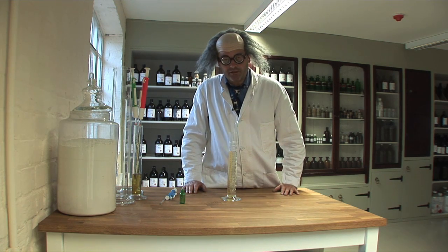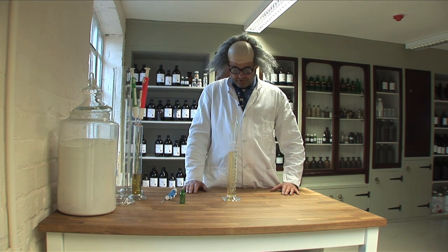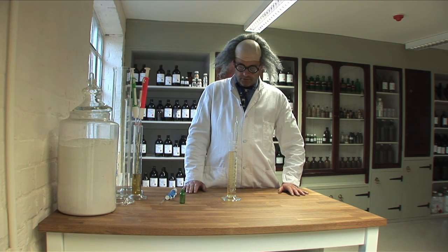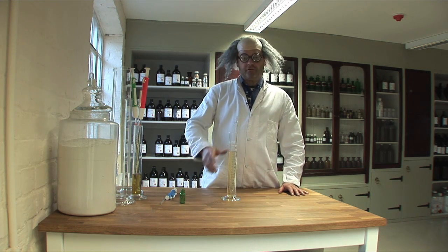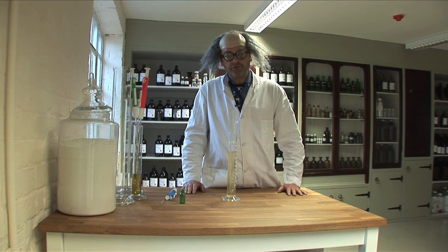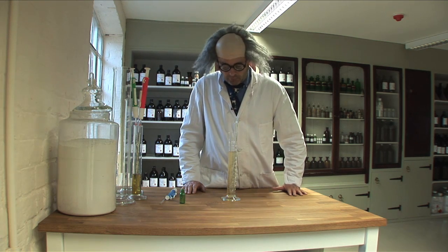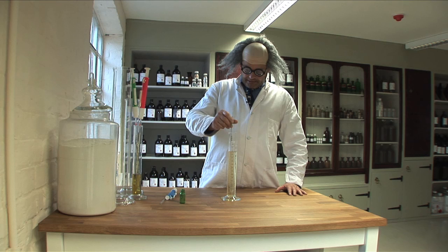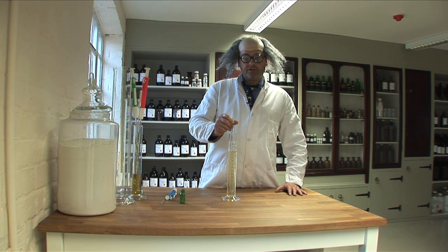In response to numerous requests from various natural perfumers, I'm going to demonstrate how to use pipettes. Now, I gather natural perfumers bunked off chemistry or they were too busy writing poetry or other artistic pursuits. Basically, using pipettes is quite simple.